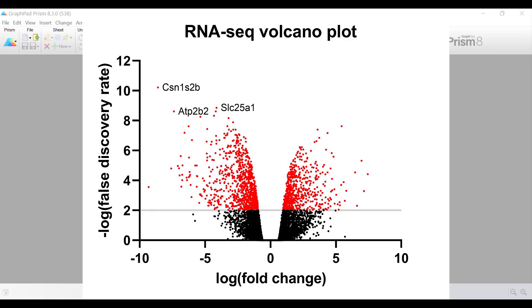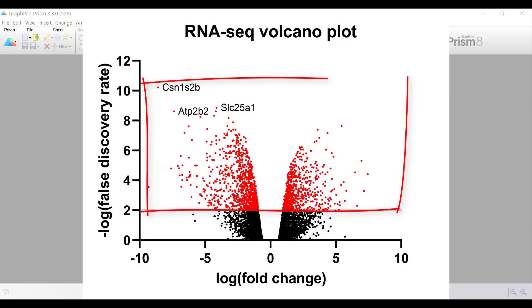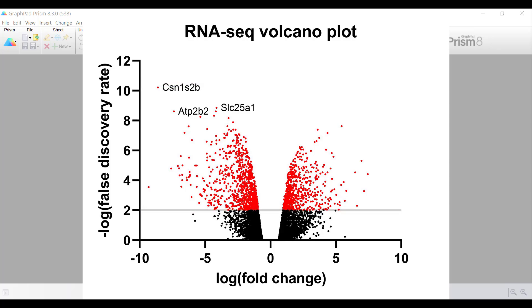The genes that are coloured red and are above the grey horizontal line are those that are above the significance threshold, which is set at FDR less than 0.01. In this video tutorial, I will show you how I created this volcano plot. So let's go into Prism and begin the video tutorial.